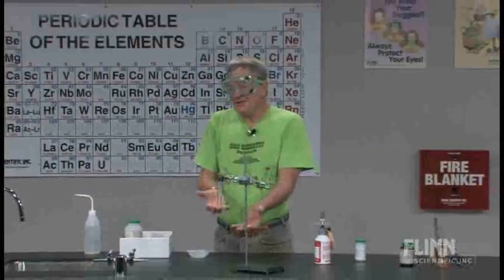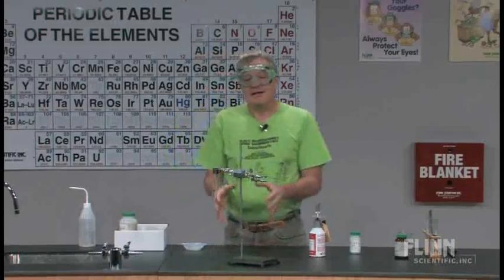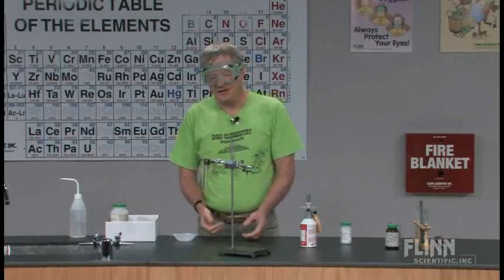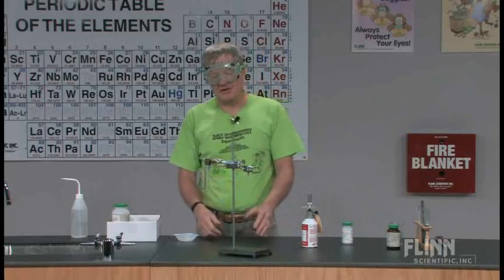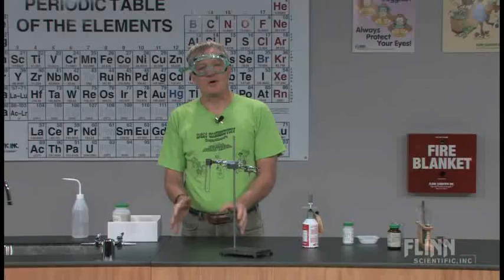That's something you want to really show your students to give them a sense of what's happening with it. The other part of it is you also want to show how the periodic table and periodicity relates to active metals and metals that we sometimes call less active, or in some cases even noble metals like silver, gold, platinum. And magnesium's a great one to work with.